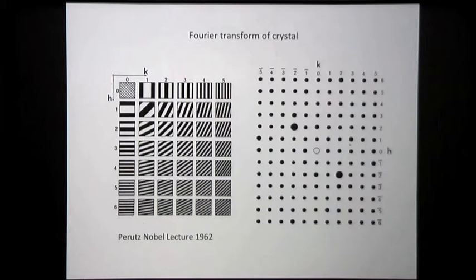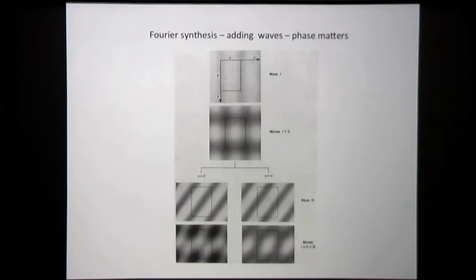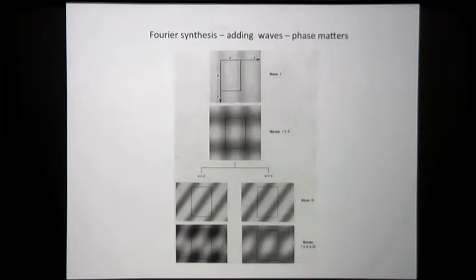but you lose the relative phase information between the different diffracted beams. And by that we mean that in the Fourier transform, the wave can have an amplitude, that's how strongly it's oscillating up and down, and it has a position, where are the peaks and troughs relative to some fixed origin. And the phase matters, it's very important. It's actually more important, it carries more information than the intensity. You need them both, but the phase information is very important.